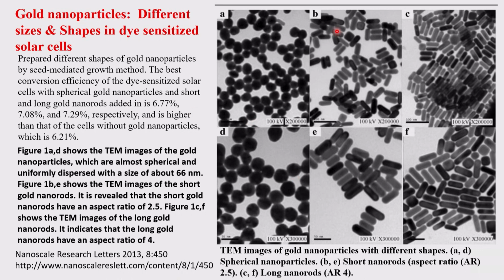So if you use a light microscope, obviously you will not be able to see at all any clarity, no resolution will be there. This entire film will come like some kind of a blurred thing and you will not be able to see that. Here you can see the shape, size, dimensions, everything you can do that.